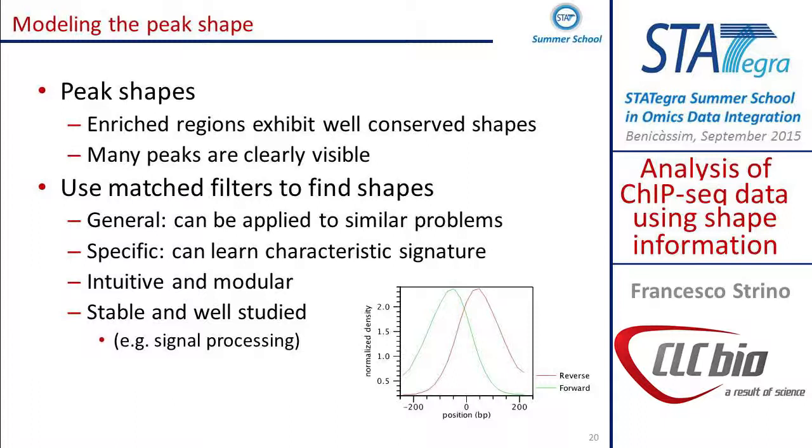And one other big advantage that is quite intuitive, so you know that you're playing with the shape, and modular in the sense that you can learn the shape, apply the shape, so you can maybe tweak how you learn the shape or tweak how you apply the shape. And it's used a lot in signal processing, so it's quite stable, and you know what's going on, so it's quite well studied.